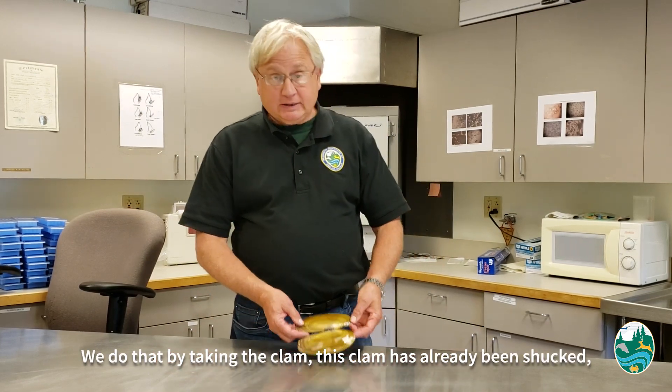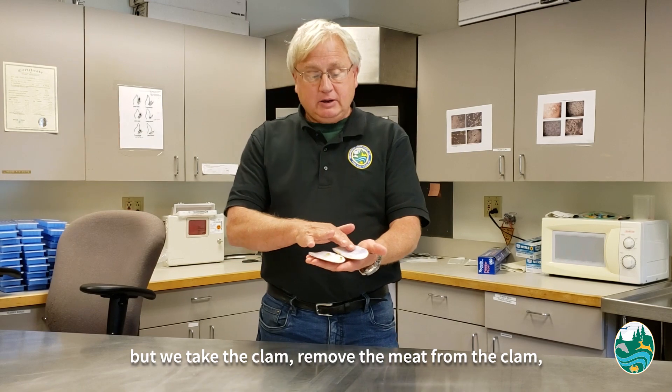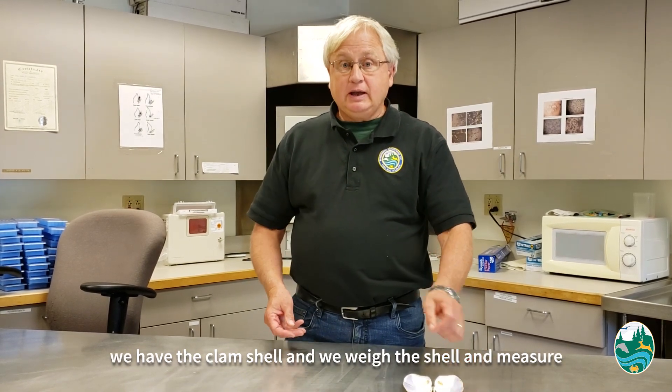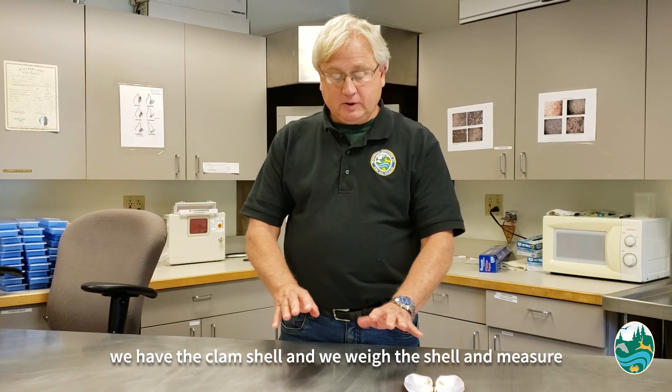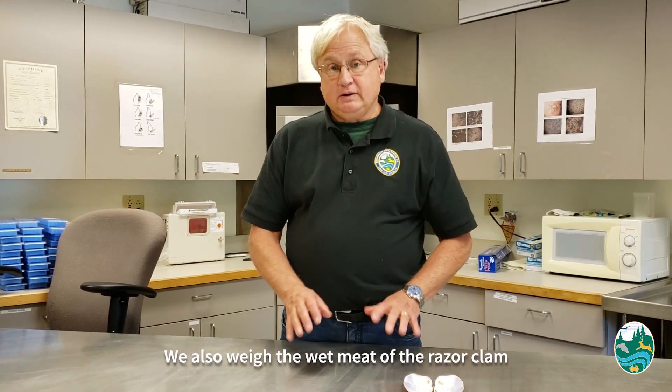We do that by taking the clam — this clam's already been shucked — we take the clam, remove the meat from the clam, we have the clam shell, and we weigh the shell and measure the length of the shell. We also weigh the wet meat of the razor clam.